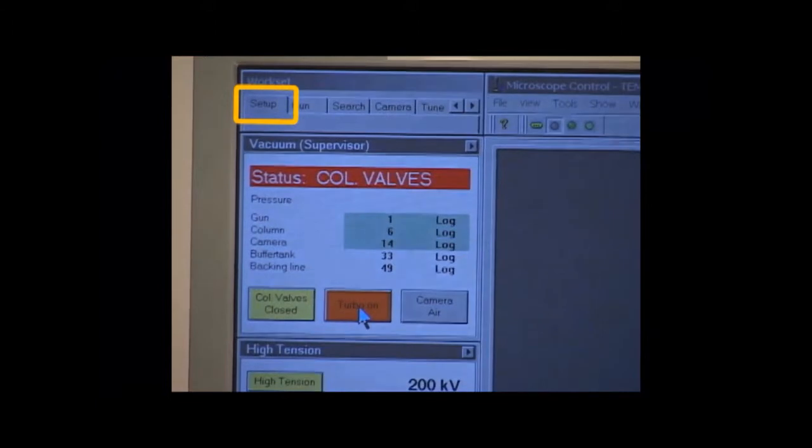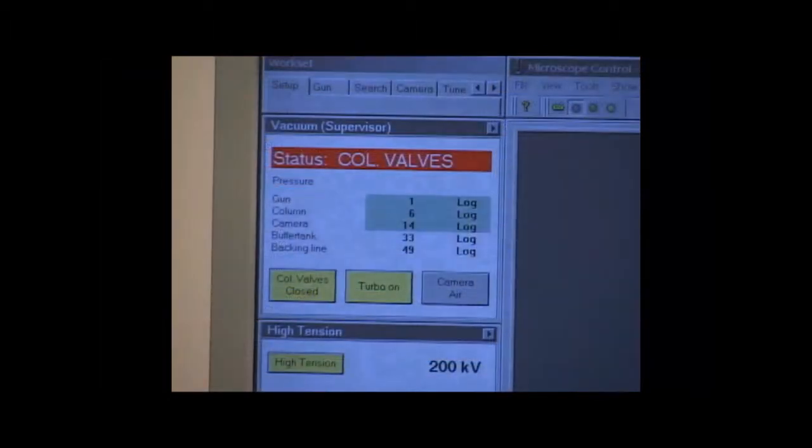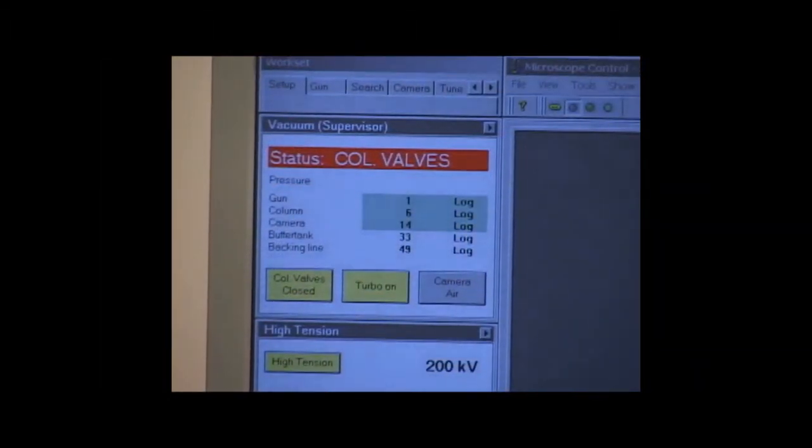Select Setup, Vacuum, and Turbo On, and hear the vacuum pump sound. After three minutes, the Turbo On box changes to yellow.